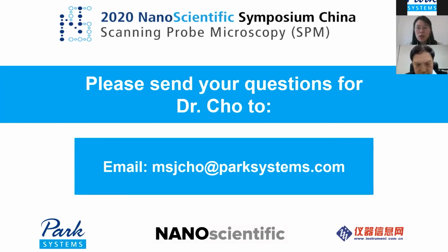So one more question is, what probes are used in PIFM? Should they be matched to the materials under study? Right now, they are metal coated probes. And I think that you don't need to match the probes to the materials exactly, because the IR laser affects the tip end and the material dipole interaction. So actually, you don't need too much concern about matching specific probes to the materials. Okay, thank you very much.